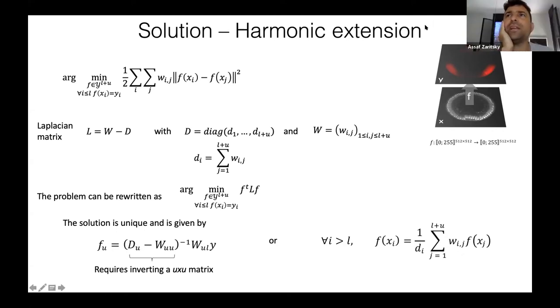Well, how many images did you have? It was about 800 or 1,000, so not many images. So you think even today a deep learning technique would not be appropriate here, because of the amount of data, or because now with all these mapping papers... Yeah. I have a slide about this just after, but it's true that this concept is very similar to something that you could do with deep learning. The limited number of samples that we have here would totally prevent a deep learning approach from scratch, but maybe with a technique that uses transfer learning, we could probably have similar results.